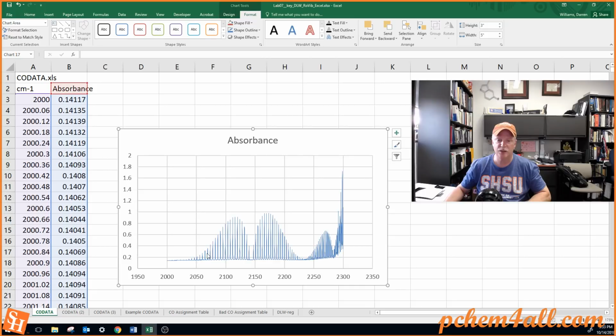But notice you don't just pick every maximum in a region, because there are some little peaks buried in between here. So we need to discriminate between the real signal of carbon monoxide and some of these other fake signals. They're not really fake, they're just not carbon monoxide, carbon-12, O16. So what's the quickest way to peak pick this spectra?